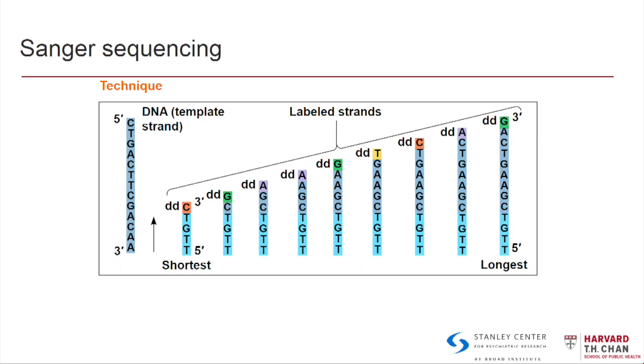So here's this sort of shown in practice. In this first example, you'll see that the very first nucleotide grabbed was actually fluorescently labeled. So that's as long as this chain ever got, just one nucleotide long. And you'll end up with a bunch of different strands of varying lengths depending on how many cycles of nucleotide addition were completed before hitting a fluorescently labeled one.